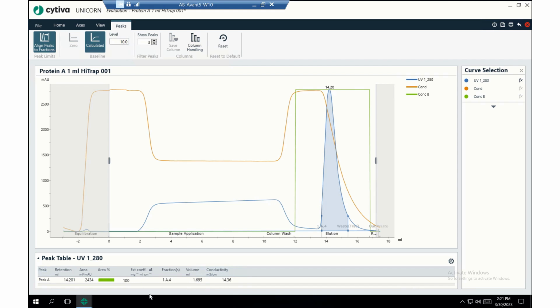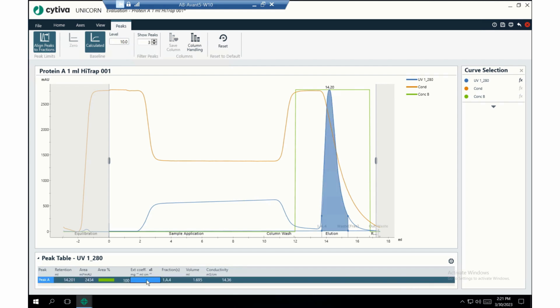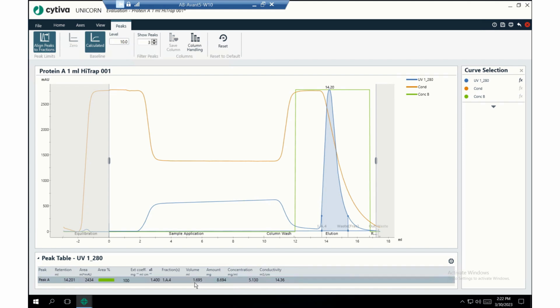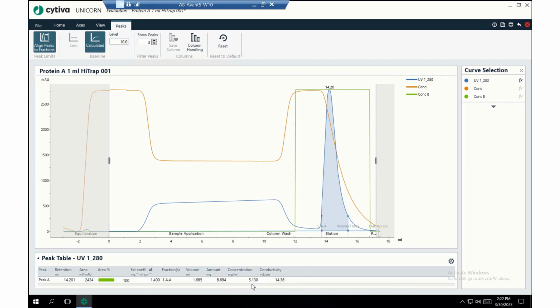And since this is an antibody, we can just type in the extinction coefficient that we know here, which is 1.4. Now, if you don't know how I got 1.4, or that you can do this in order to calculate the amount of antibody in here, I made another video about doing this, and I'll put in a link to it somewhere in here. I'm still kind of getting used to this. We came out with 8.69 milligrams in 1.69 mils with a concentration of 5.1 mg per mil. So we'll just call this 8.7 mgs, which is really good.